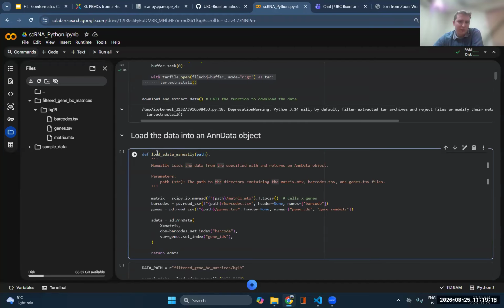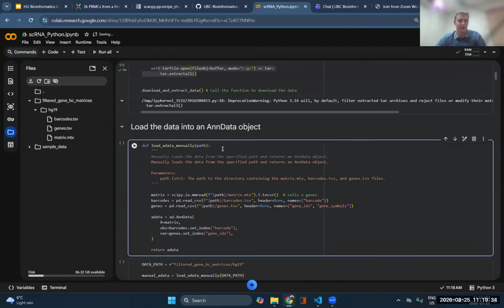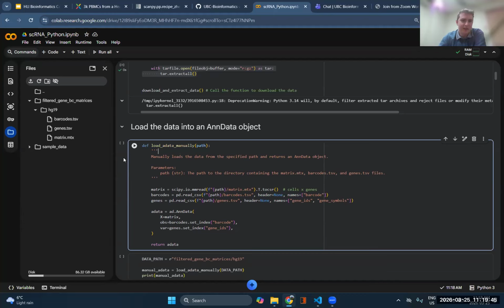So here, I've written this function, and hopefully you're able to follow along with the code, even if you don't understand what everything means, because I know with Python, it's a little different than R. Like I'm using def here to define a function. That's similar to R, where you might write the function name, then the body. It's the same idea here. It's a little bit different syntax, but the idea of functions is still the same.